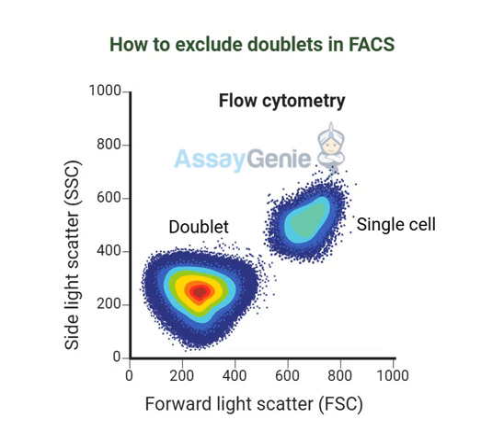But how do scientists even know these doublets are there? I mean, cells are tiny. It's like a microscopic game of hide and seek, right? Totally. But scientists have this amazing tool called a FACS machine. It shines a laser on the cells and measures how the light bounces off. A laser? For cells, that's pretty high tech. So what can scientists learn just by looking at how the laser light bounces off these tiny cells? Well, for one, they can figure out the cell's size.